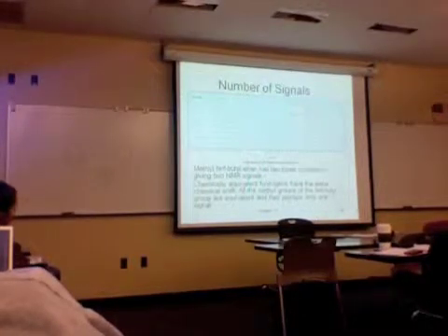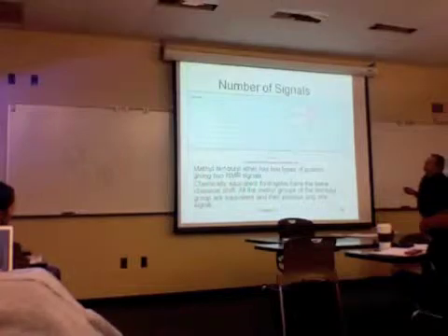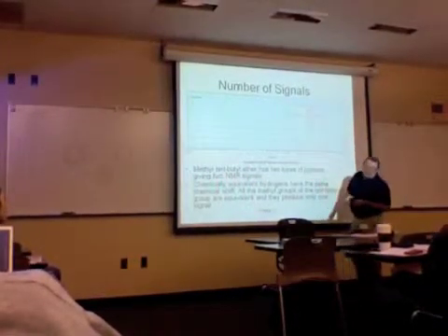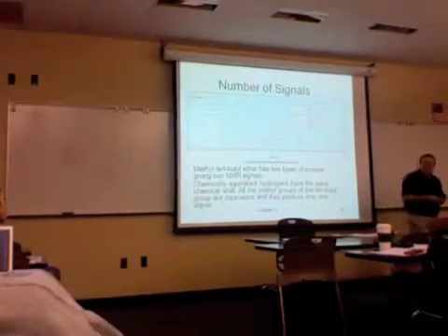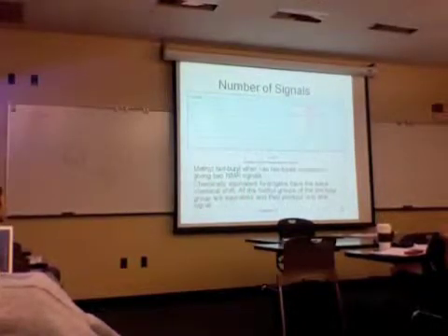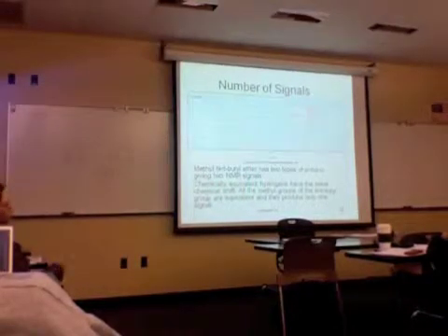How are we doing? By the way, this peak is a lot bigger than that peak. What's up with that? Integration. It should be a 3 to 1 difference in area under the signal, because the number of hydrogens signaling is reflected in the size of the peak area. Okay.